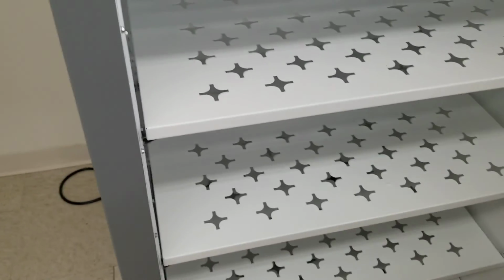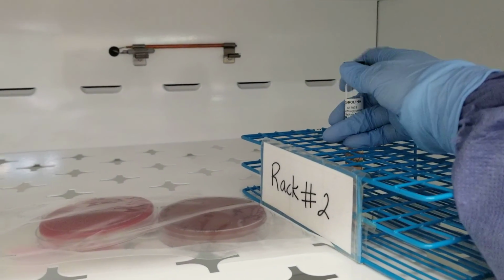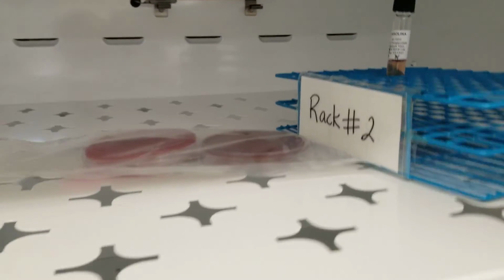And I'll put it in there with that one so that we can see, even if there isn't any growth on the plate, we can see if it's going to grow into the thio and check that out at the end.